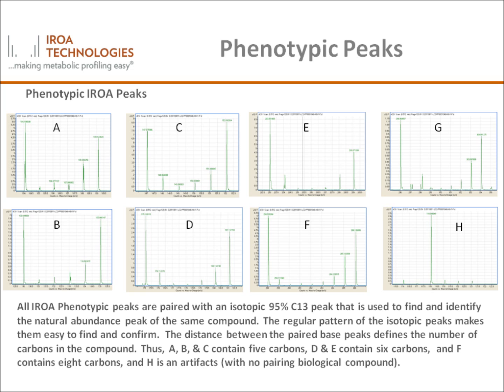If the pooled standard is well characterized and the compounds that are present in it have already been identified, then it will be able to be used as a point of comparison for all of its contained compounds. Artifacts will have no match in the standard and are eliminated by ClusterFinder in the final data set. In the phenotypic experiment, all experimental samples are measured relative to the standard. Therefore, the phenotype is defined by the deviation from the standard.